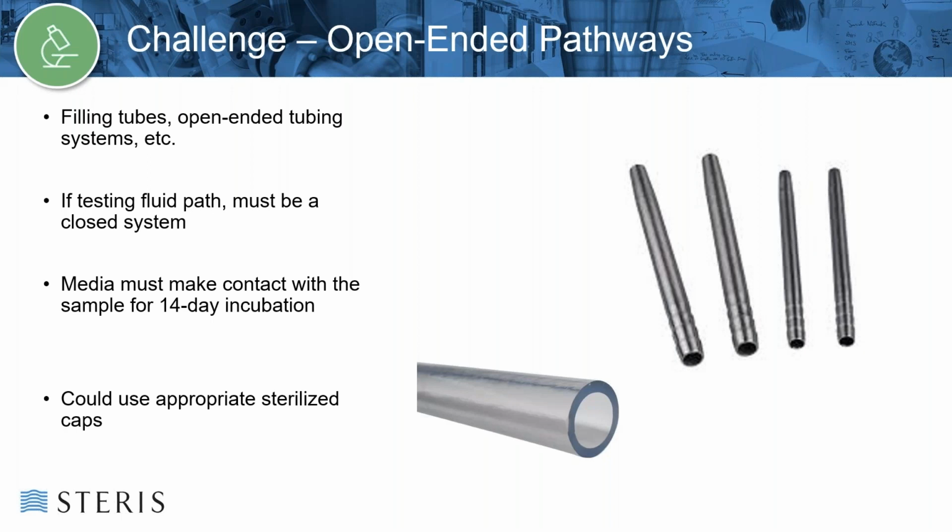Additionally, if we're using caps or fittings or clamps to close ends, the closure needs to be significant to not allow microbial ingress during the 14-day incubation of the sample. It is possible to use appropriate sterilized caps, provided they do give that closure that we need to ensure that the test is not getting contamination in during incubation and handling.